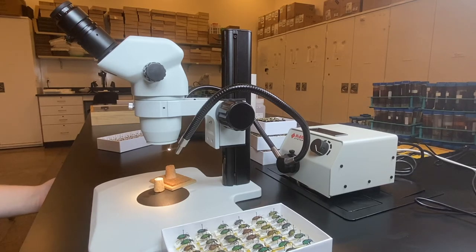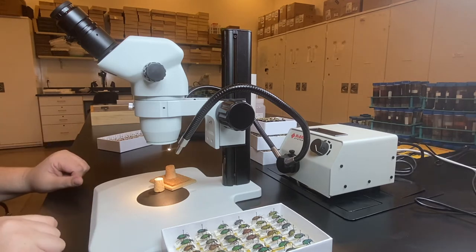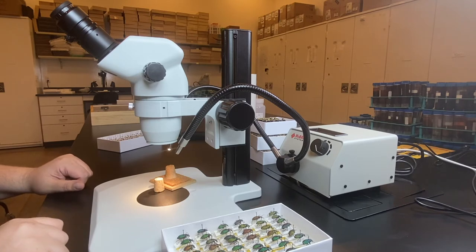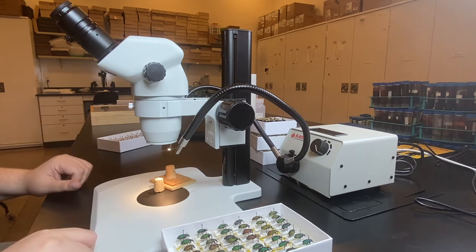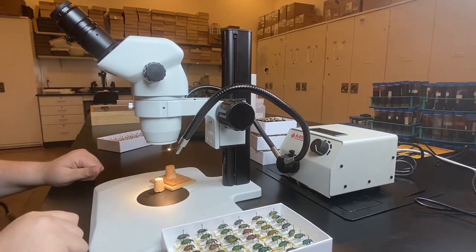In this video we want to talk about handling pinned specimens. Almost always this will involve a microscope, and the first thing you want to do is something that's often not taught in any of our classes or training — you just have to learn by doing it — and that is how to set the microscope up for yourself.